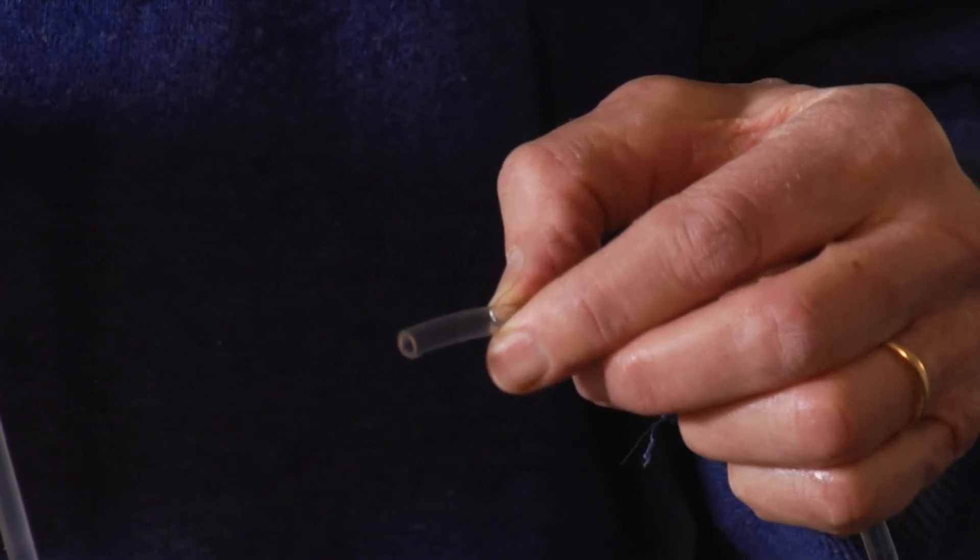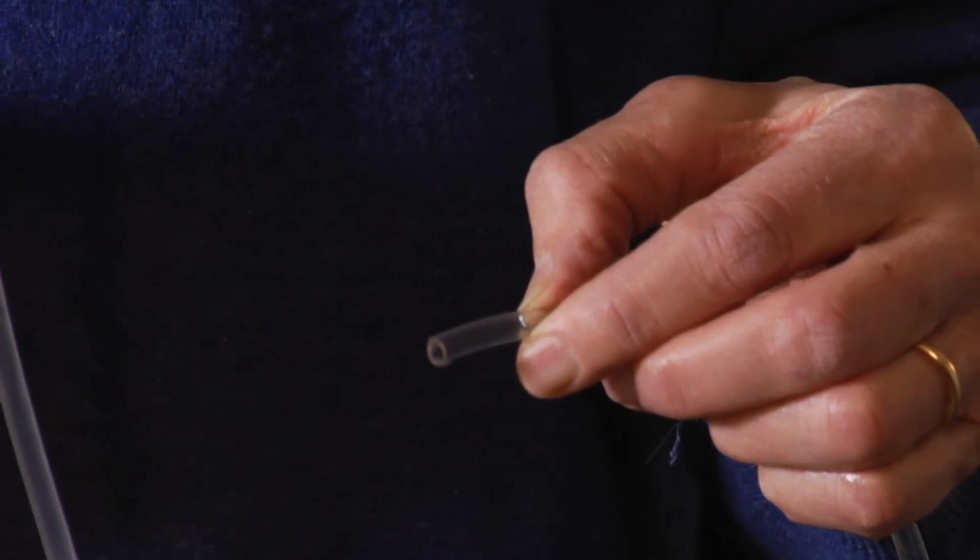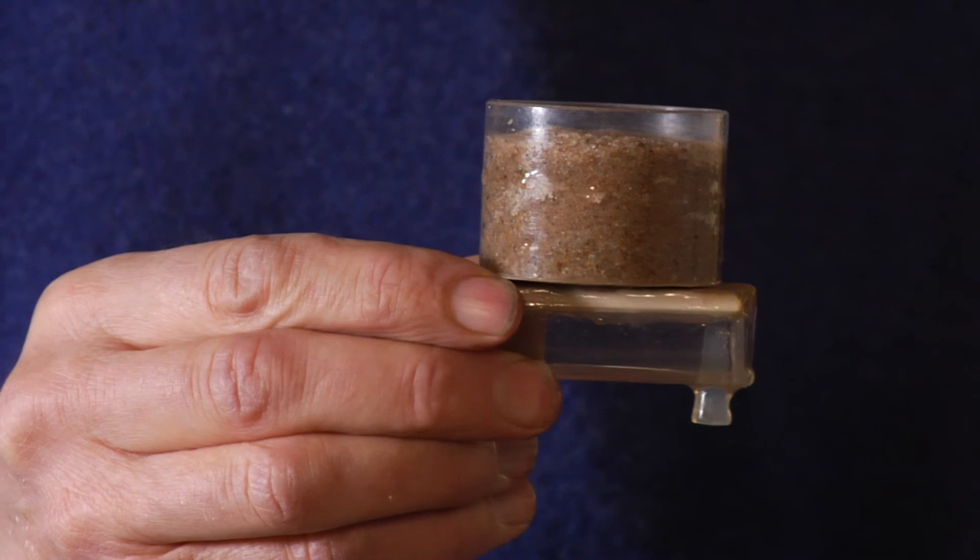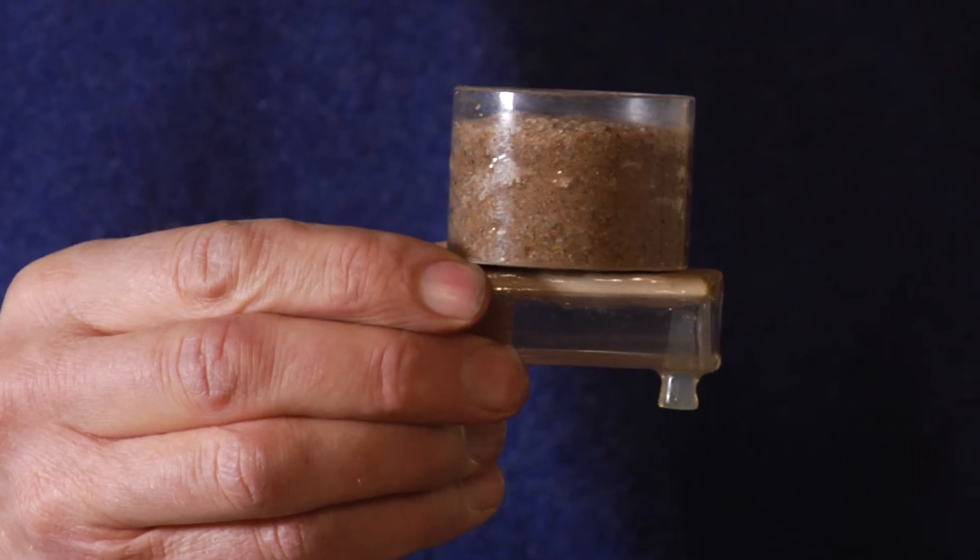The pores in the sand are much larger than the pores in the plate, and they are emptied by a smaller suction. You can also see how the sample gradually becomes lighter as water is replaced by air.